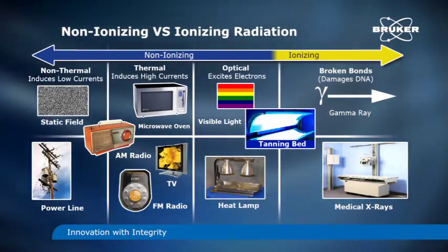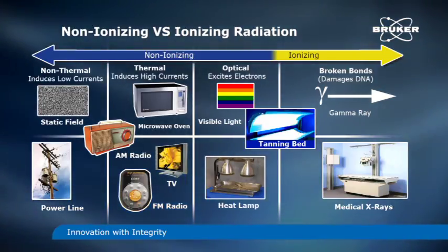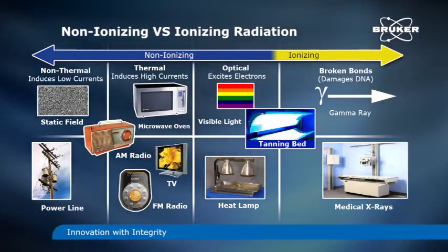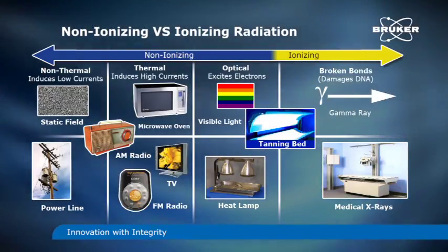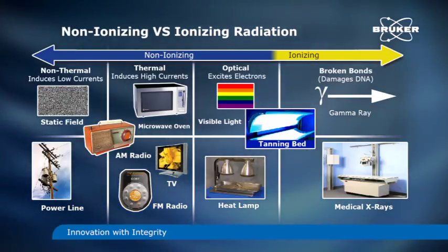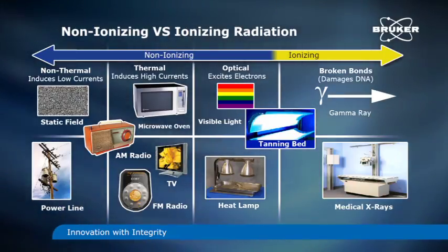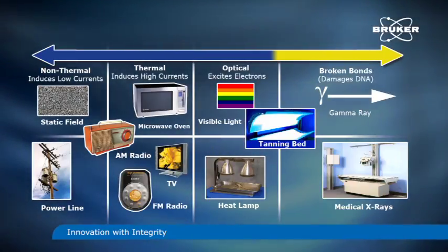There are four types of ionizing radiation: alpha particles, beta particles, gamma and X-rays, and neutron particles. The process of ionization is important because it affects chemical and biological functions of the cells in the body and can be used to detect radiation.